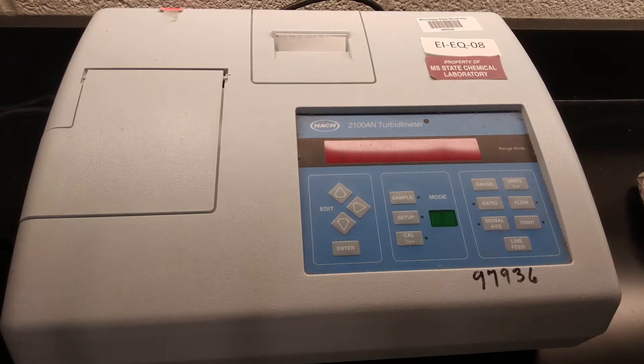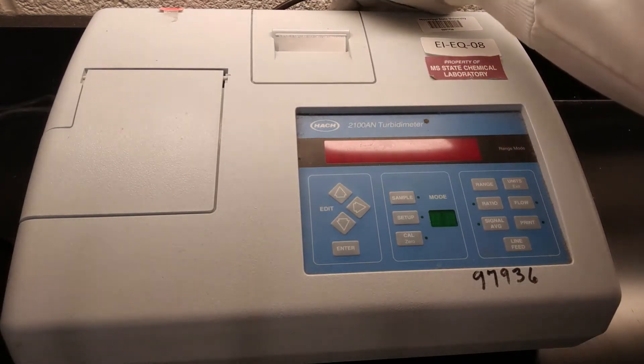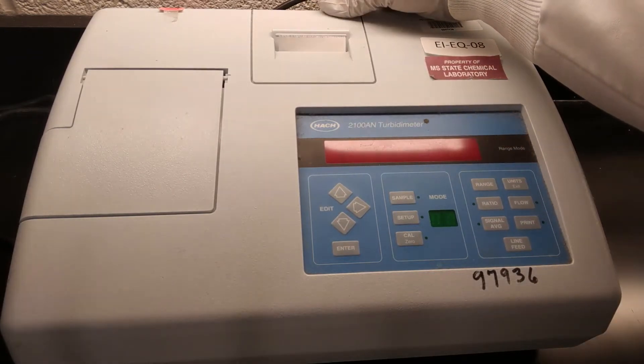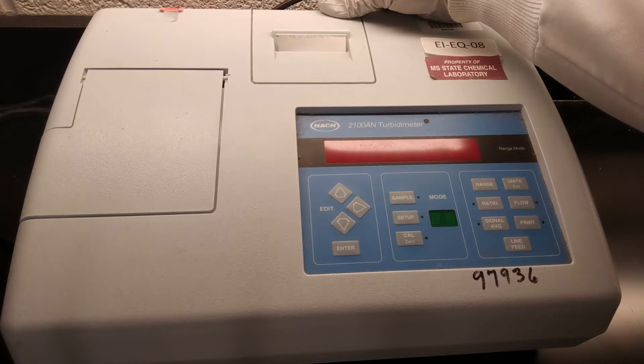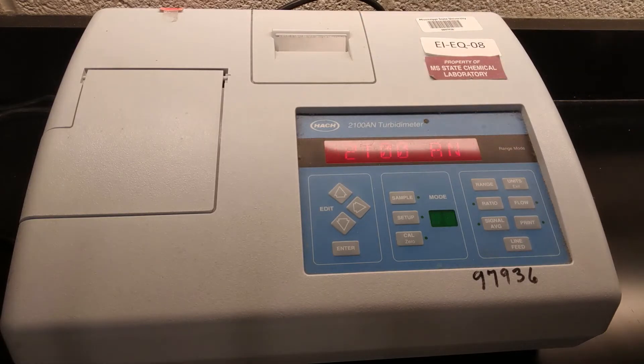To start up our turbidometer, there's just a switch on the back, just a little bit behind where the paper comes out of the printer. We can flip that on and you can hear it doing some mechanical things. I think that's the printer starting up and you can see the logo showing up, the 2100 AN. It takes about a minute for this instrument to start up.